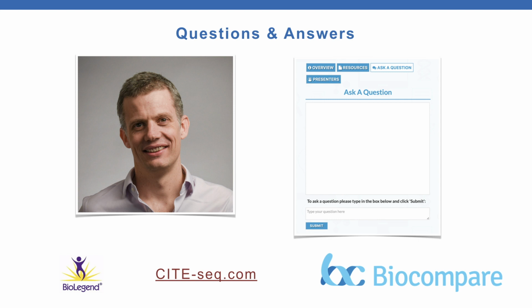Would you recommend polyclonal antibodies over monoclonal antibodies for conjugating to oligonucleotides? No, I think monoclonal antibodies. If all you have is a polyclonal antibody, then you give it a try for sure. Most antibodies that are produced by BioLegend or any other company out there are monoclonal. That's very beneficial for a number of reasons. It's a well-characterized binding event. There's very little batch-to-batch variation.